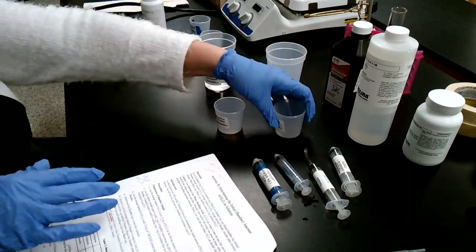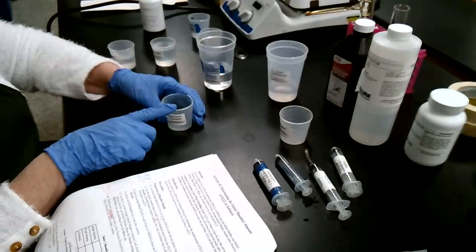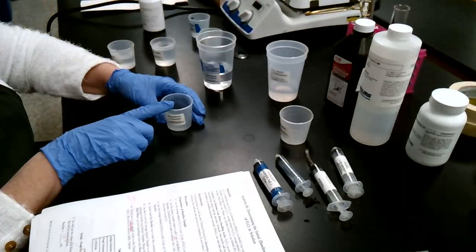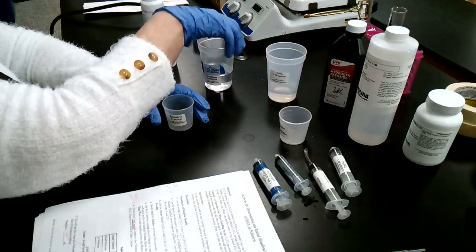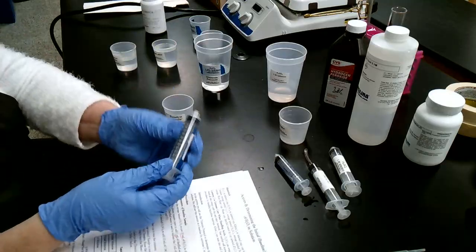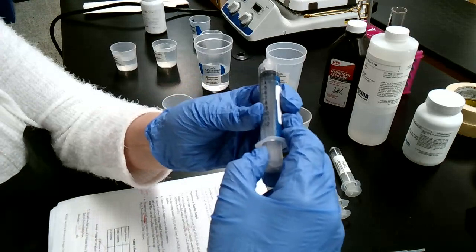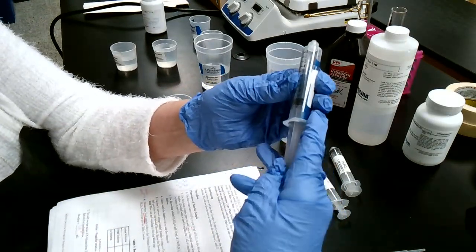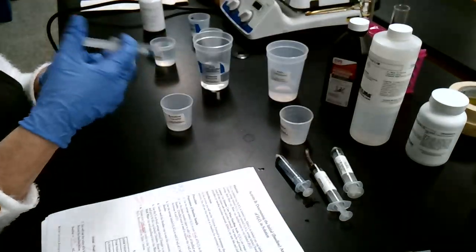All we're going to do, I'm going to set this titration thing aside. In the baseline cup, we're going to put 10 milliliters, and this is following the directions. First direction is to put 10 milliliters of hydrogen peroxide. So I took my hydrogen peroxide and poured some in a cup so it's easier to get at, and I'm going to take 10 milliliters. And you'll see the markings on these syringes. I'll have to pull that all the way up to the 10. I can pull it up beyond that, but then squirt some out. And then once I get it to the 10, I can squirt it completely in here.